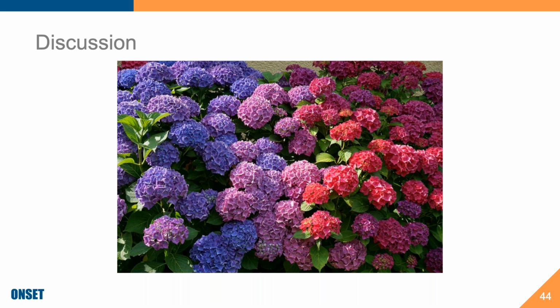Thanks, Alex, for attending. Is it okay to deploy the Onset sensor with a copper guard in salt water? It most certainly is. As a matter of fact, that's pretty much where we would recommend using that copper guard, because salty water is where you're going to have some biofouling, and the copper guard is really good for that.